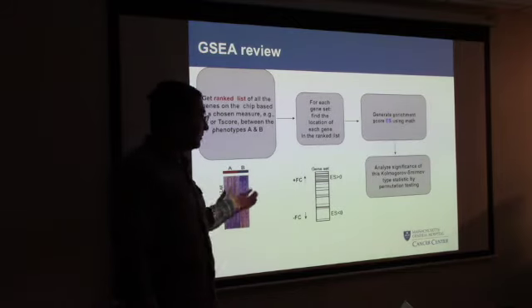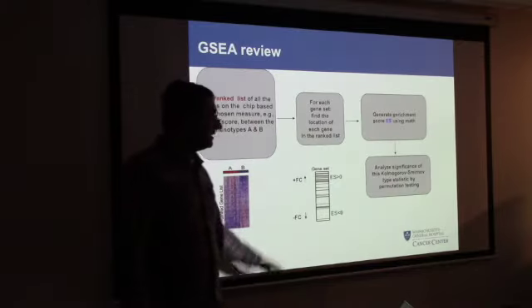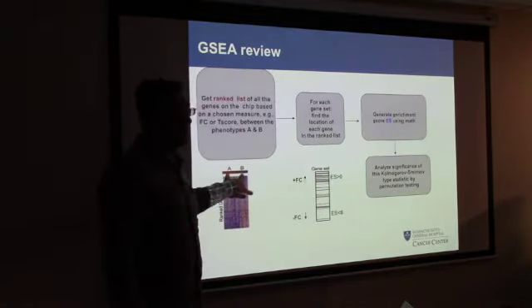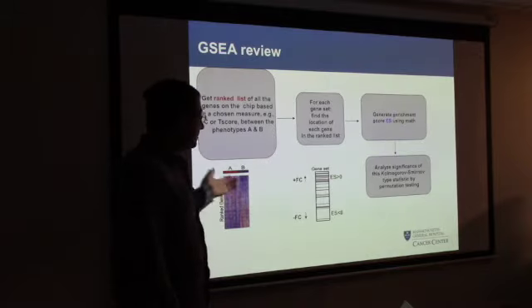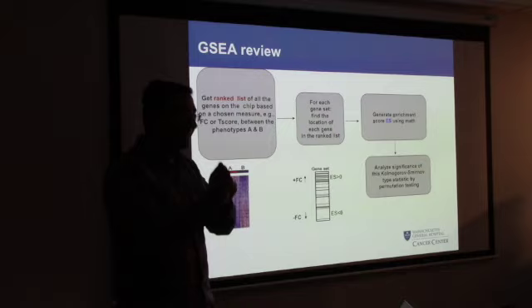And the way you do that, one way, is you can just take, let's say you have 100 genes in your gene set, and it turns out that you have a really high enrichment score for these genes in an A versus B differentially expressed comparison. Now you take a set of 100 genes just randomly, and you calculate the same enrichment score. And then you do a KS statistic test.